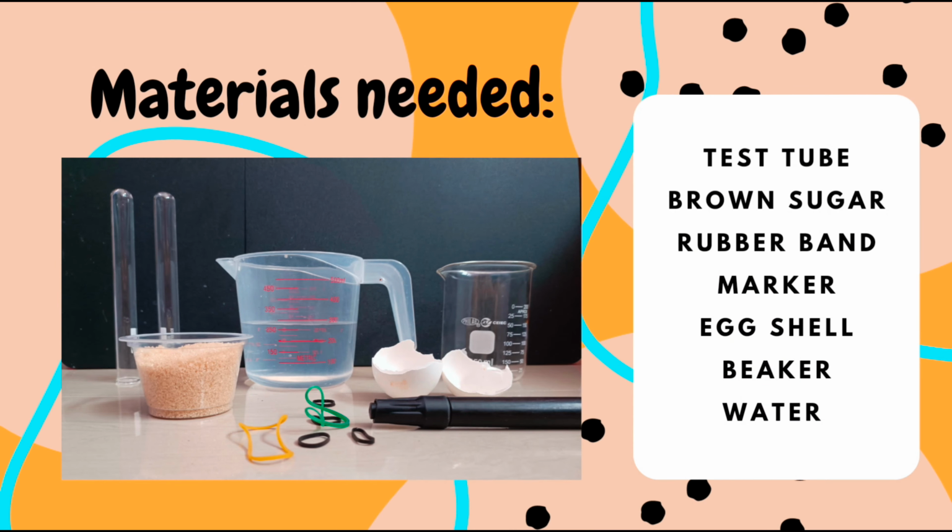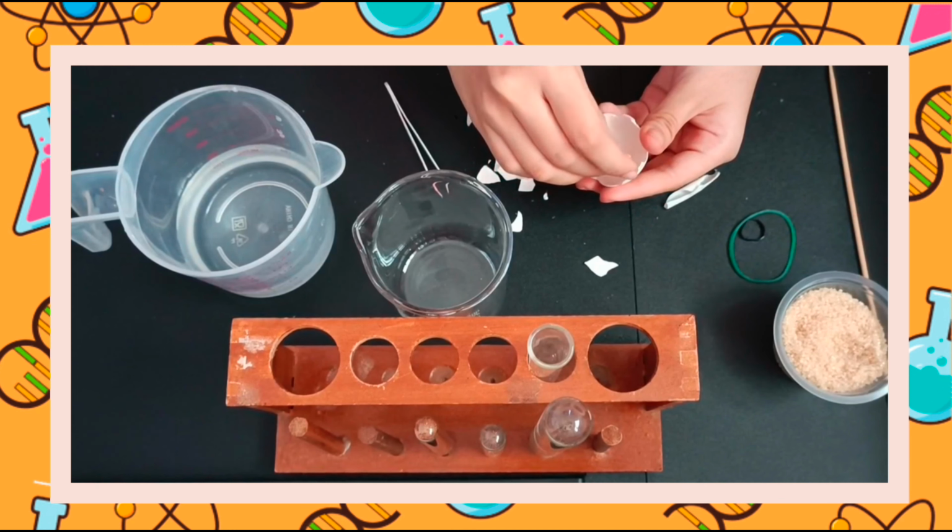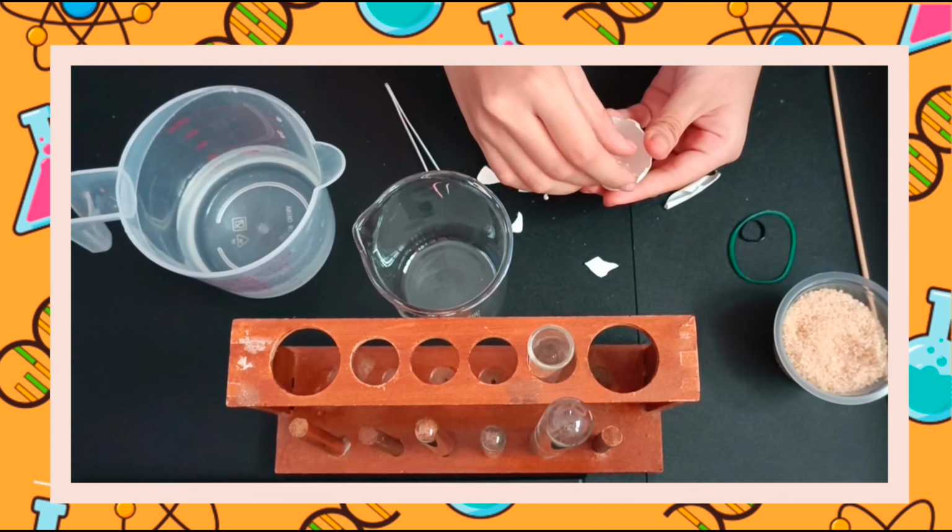The materials required in this second experiment are test tube, brown sugar, rubber band, marker, eggshell, beaker, and water. Now let's move on to the procedure. Carefully remove the membrane of the egg.